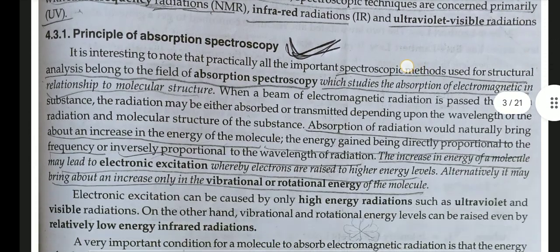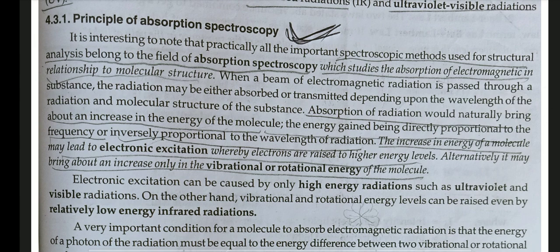Principle of absorption spectroscopy. It is interesting to note that practically all the important spectroscopic methods used for structural analysis belong to the field of absorption spectroscopy, which studies the absorption of electromagnetic radiation in relationship to molecular structure.